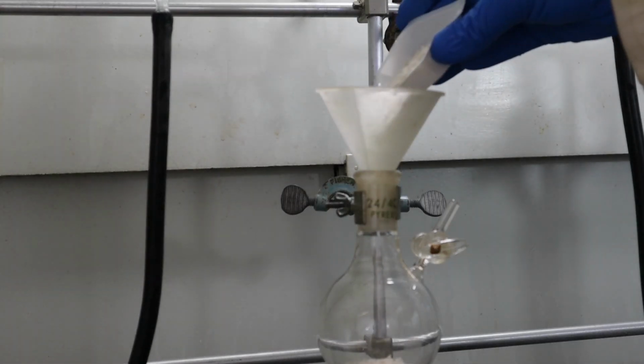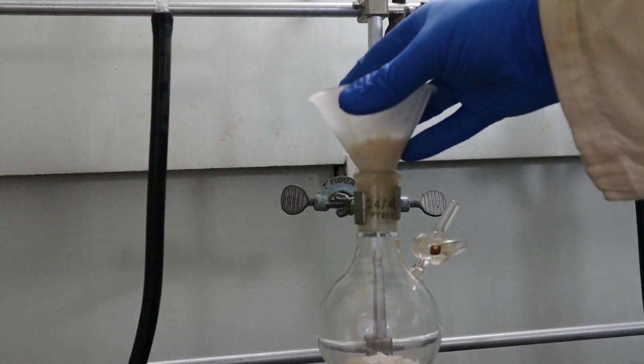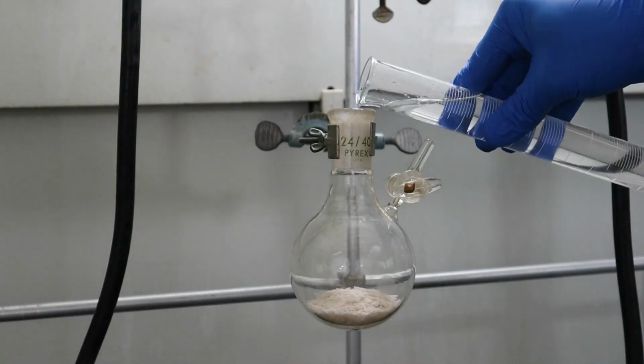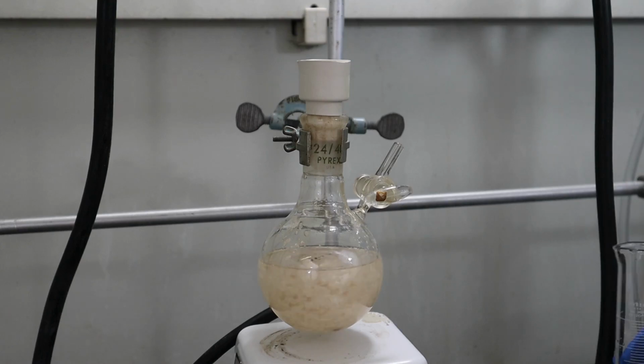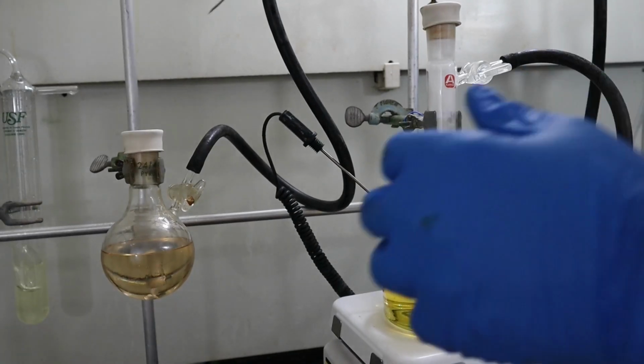I began by adding 21.62 grams of 1-naphthol to a Schlenk flask, followed by 140 milliliters of 1,2-dichlorobenzene. I closed the flask with a septum and stirred it to encourage the naphthol to dissolve. Some heating was required. Using the Schlenk line, I replaced the atmosphere in the flask with nitrogen.